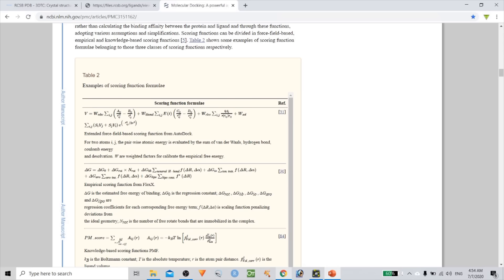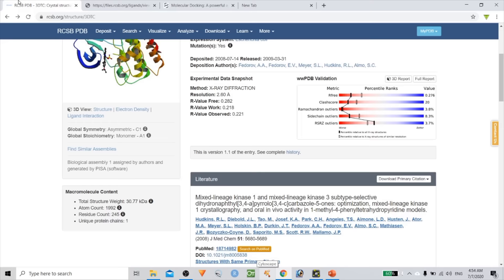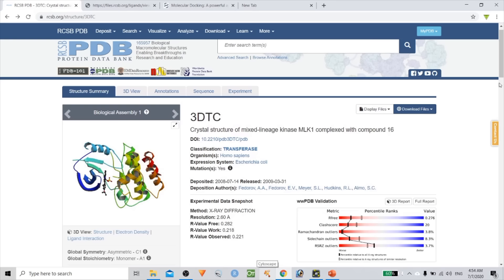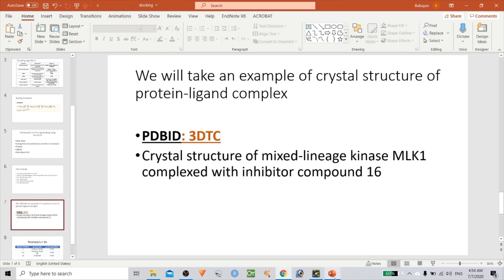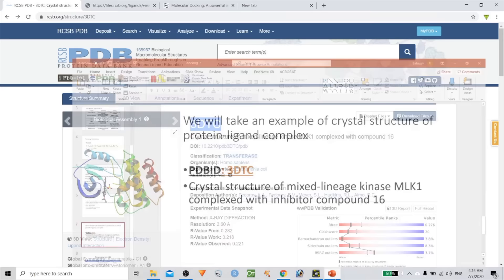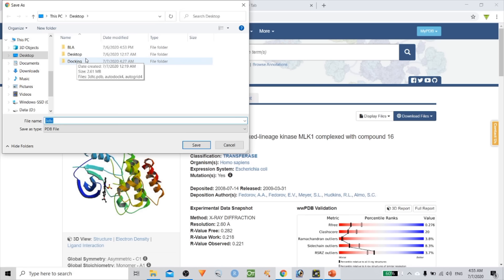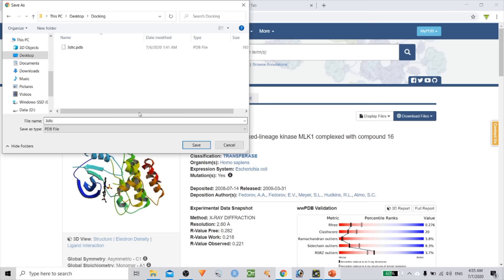We will take an example of a crystal structure of a protein-ligand complex. Go to RCSB and type the ID — here it is 3DTC. Click on the PDB file option and download the PDB file. We will also download the structure data file in SDF format for the ligand.